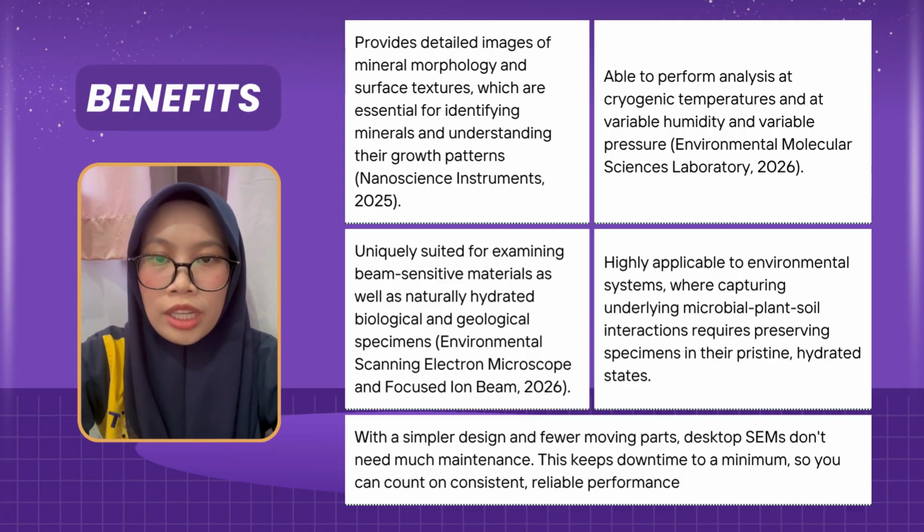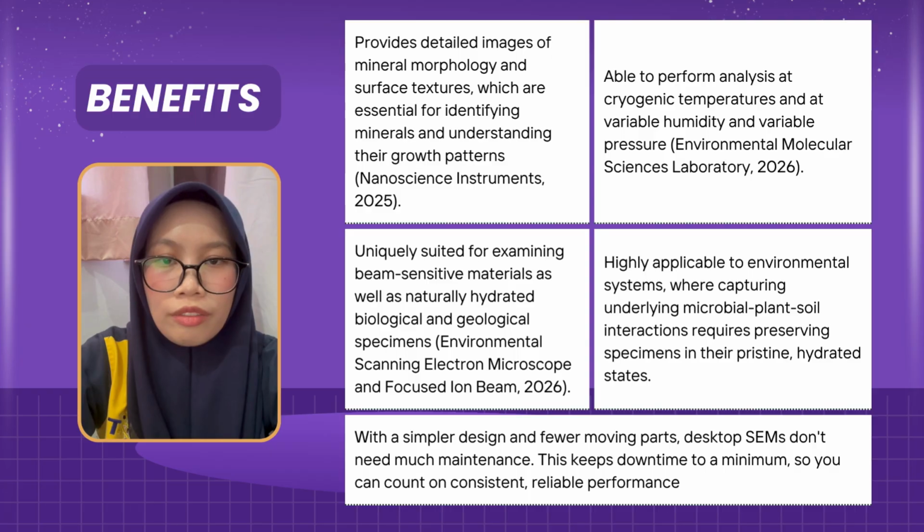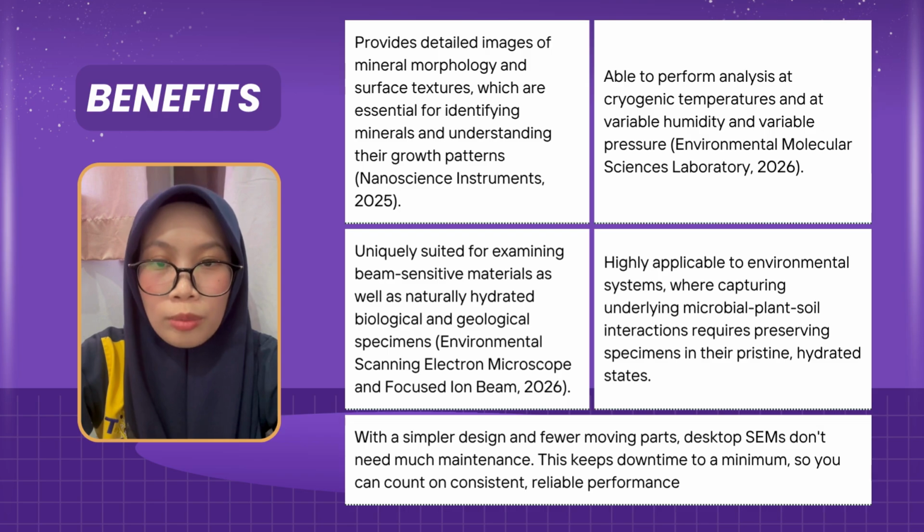For the third one, it is uniquely suited for examining beam-sensitive material as well as natural geological and biological specimens. For the fourth one, it is highly applicable to environmental systems where capturing underlying microbial plant-soil interactions requires preserving specimens in their pristine, hydrated states.